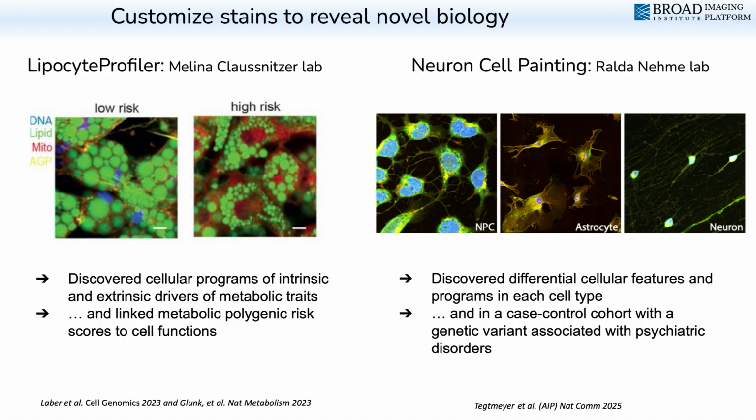You can adapt this. There's nothing sacrosanct. There's nothing deeply optimal about cell painting other than that it is cheap. You can swap it out for other biology you care about. Folks at the Broad and around the world have adapted this assay for marking other structures in a cell, and you can mark heart cells and blood cells and neurons and things like that using the same strategy.